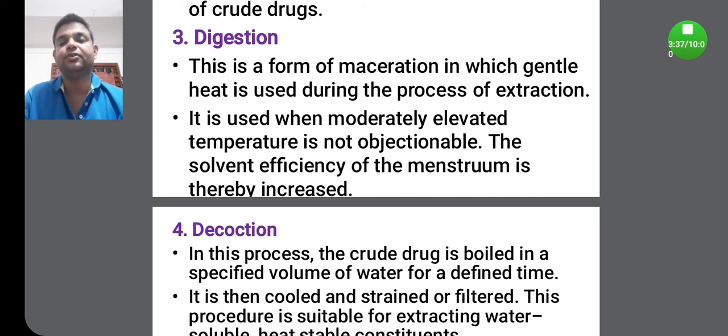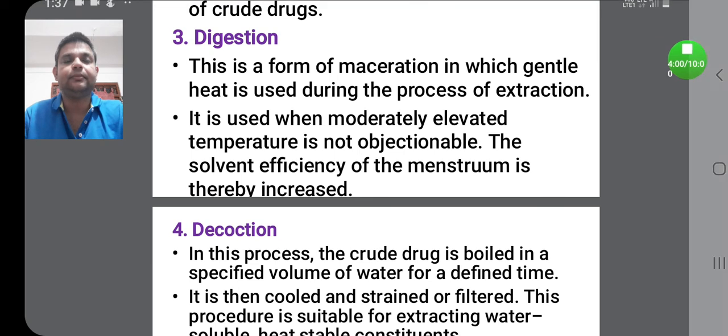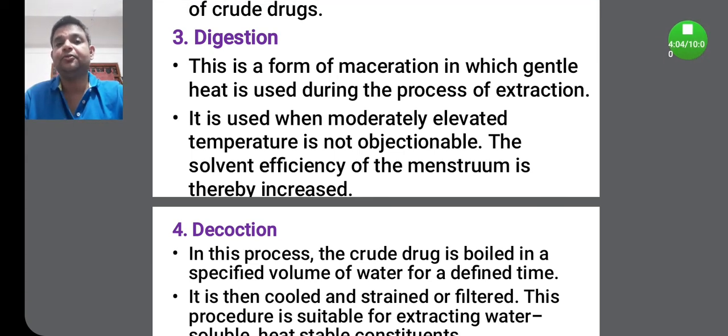As per the statement like dissolves like, polar phytoconstituents are soluble in polar solvents, whereas non-polar phytoconstituents are soluble in non-polar solvents. Let me give an example of non-polar phytoconstituents like waxes, lipids, steroids. All these are hydrophobic or lipophilic substances. So these are soluble in non-polar solvents like n-hexane, petroleum ether. Whereas alkaloids are considered mid-polar phytoconstituents, which are soluble in mid-polar solvents like chloroform. And the polar phytoconstituents like glycosides, tannins are soluble in polar solvents like alcohol, water, etc.